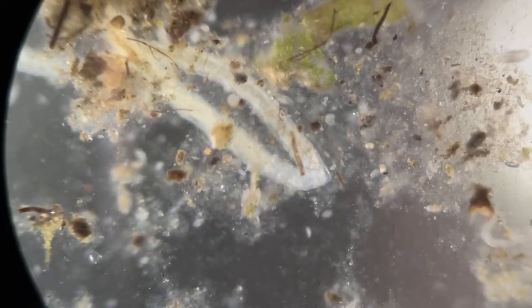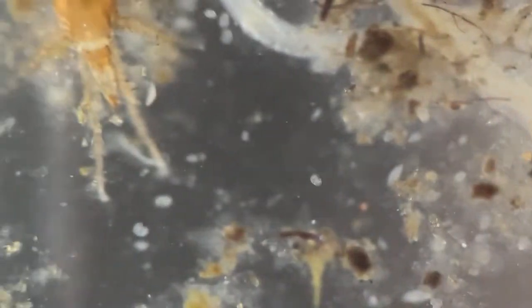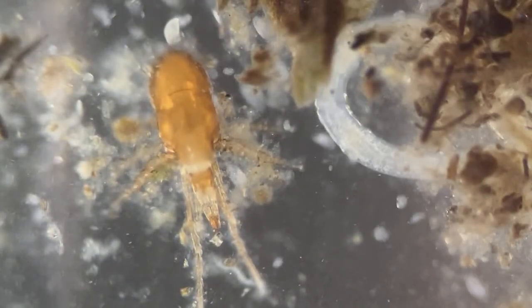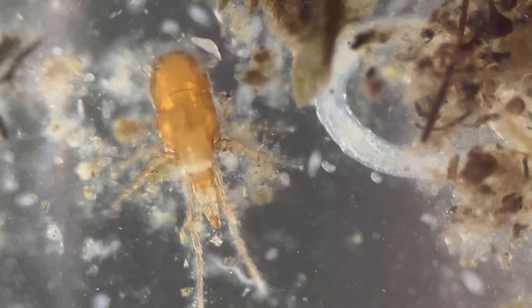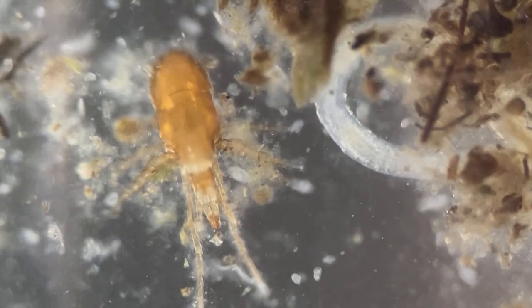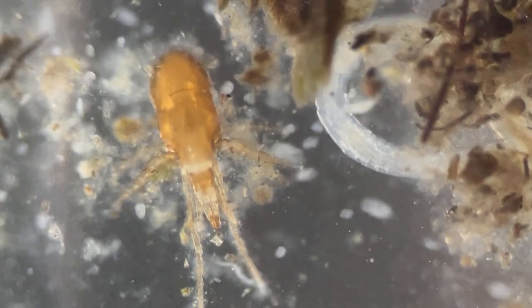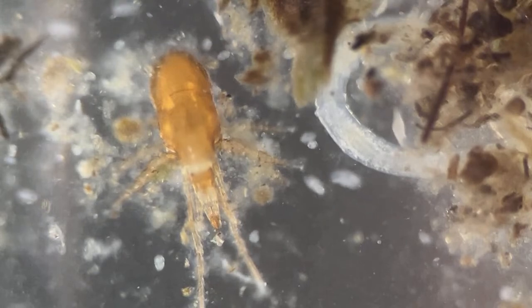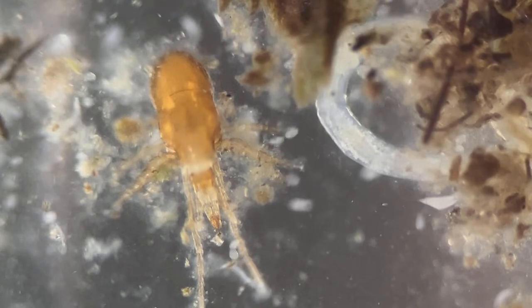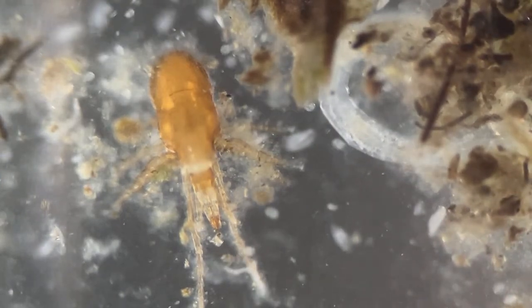Zoom out. Oh, interesting. I'm tired of standing up for so long.